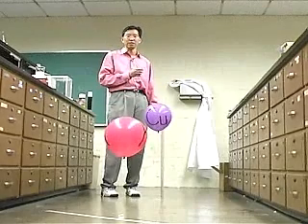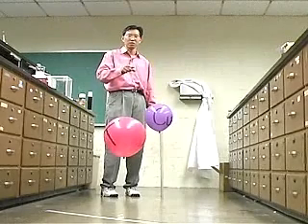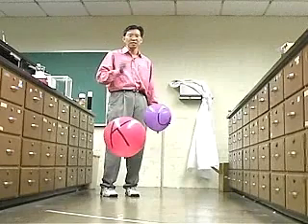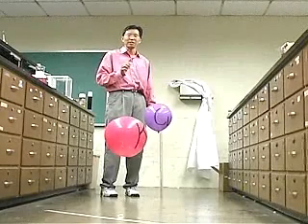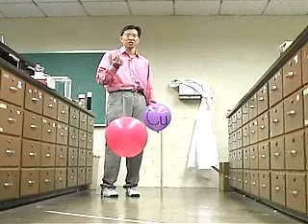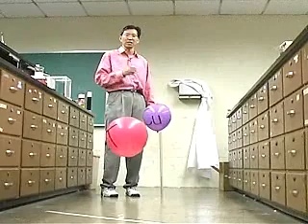Well, we're not going to use gunpowder here. What we're going to do is use the hydrogen balloon explosion, and what I have prepared here are two balloons, one that contains potassium carbonate and the other contains copper chloride. It doesn't much matter what the source of the metal salts is, but the other key ingredient in the balloon is hydrogen. I'm going to touch off these hydrogen balloons. The hydrogen will react with oxygen and explode. It'll excite the potassium or the copper, and then they'll relax and we'll see the colors that come out.